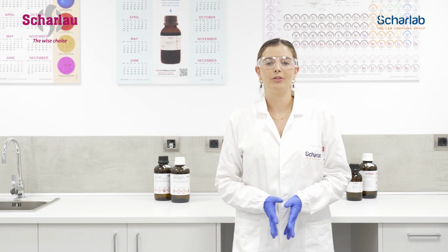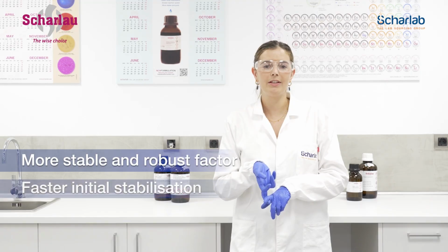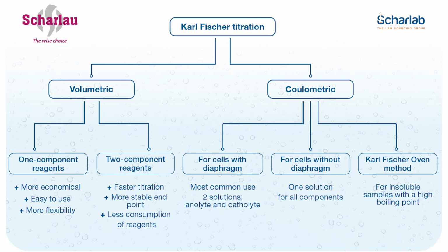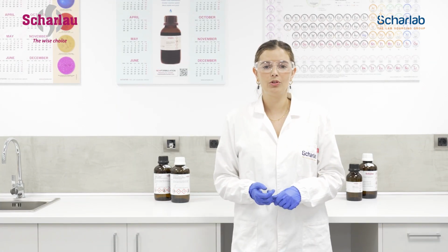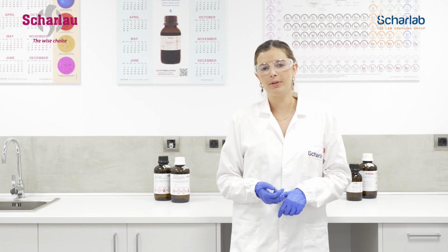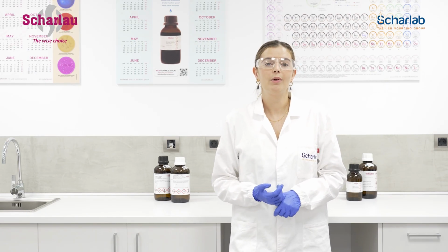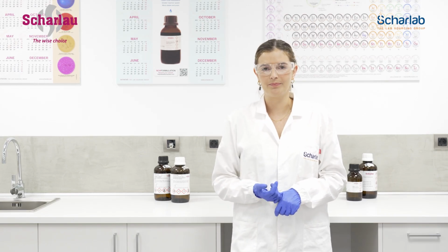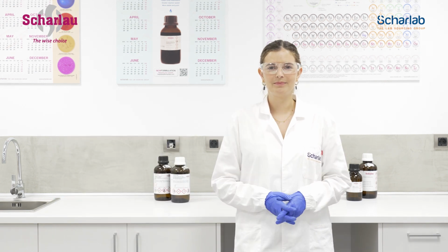Some of the advantages of the new formulations are a more stable and robust factor, faster stabilization, and a more stable endpoint. That being said, are you unsure when to use a volumetric reagent or a coulometric one? In general, we will choose a coulometric reagent for water contents below 0.1%, that is 1000 ppm, and a volumetric reagent for water contents above 0.1%. In today's video, we will focus on volumetric reagents.